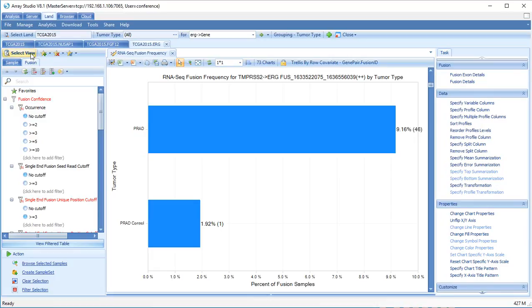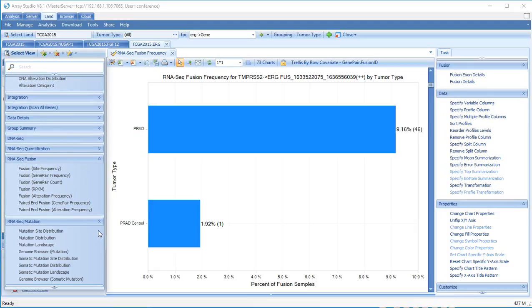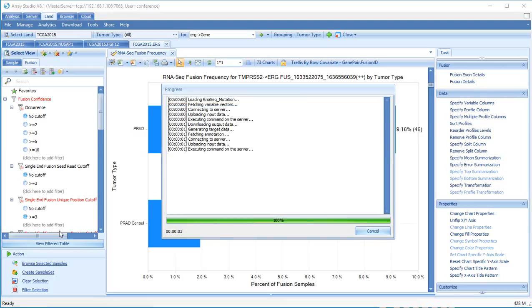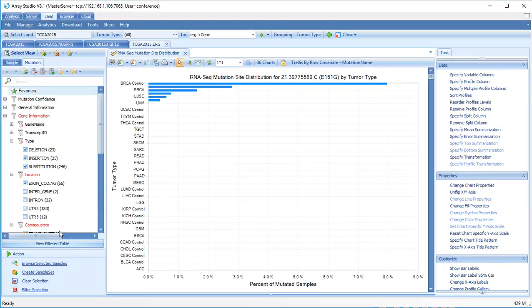Mutations can be detected in RNA-seq data, which are found using Omicsoft's mutation detection algorithm. Under RNA-seq mutation, choose the mutation site distribution view. This displays the frequency of identified mutations in each tumor category. Details of the types of mutations considered can be changed in the Mutation Filter tab. For samples with matched tumor and normal RNA-seq from a single patient, somatic mutations can be called, and these events can be seen in the Somatic Mutation Site Distribution view.